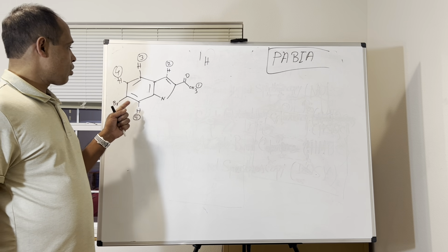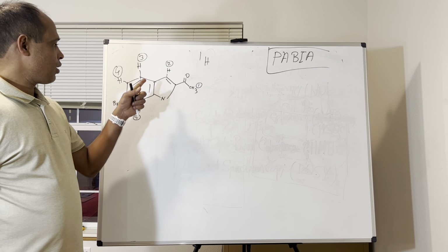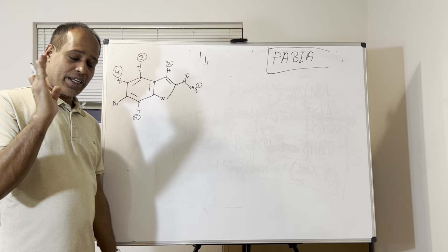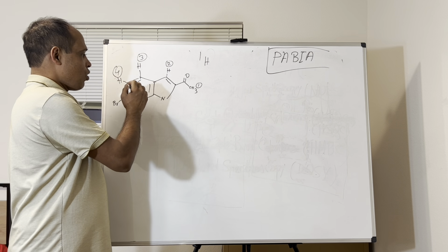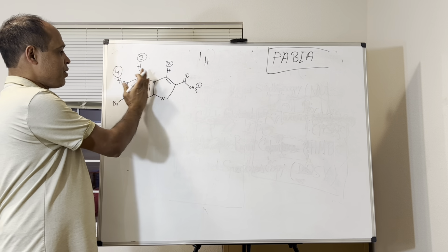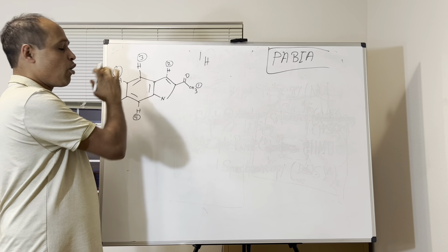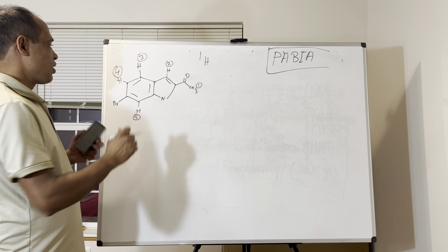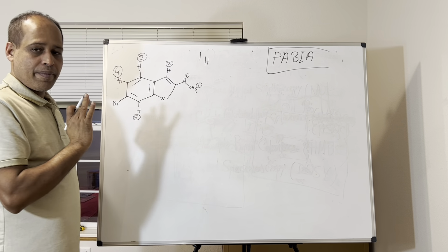so with the COSY, first of all, this is very important, you need to know. So you see this is an aromatic proton, right? Aromatic, 1 benzene ring. So how many aromatic protons? 3, right? That is 3, 4, and 5.